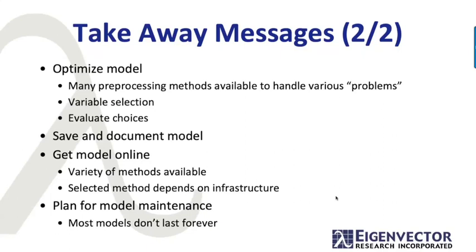And there are some things that don't work correctly, like you need to do a multiplicative scatter correction before you take a derivative. If you try that the other way around, it just won't work. In general, though, there's a lot of pre-processing methods that don't matter what order they're in.